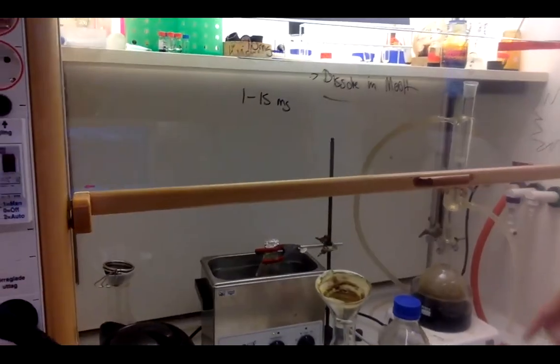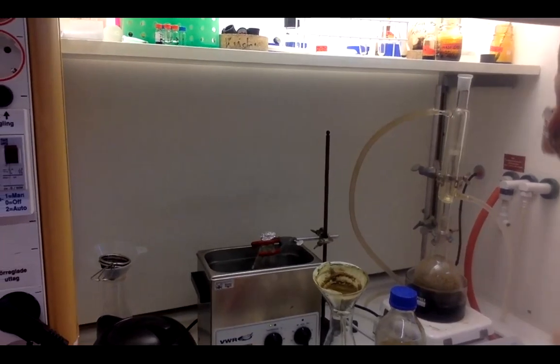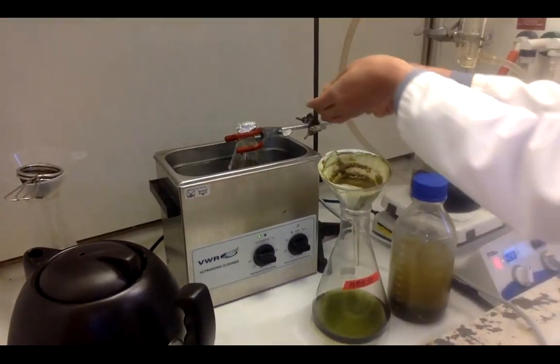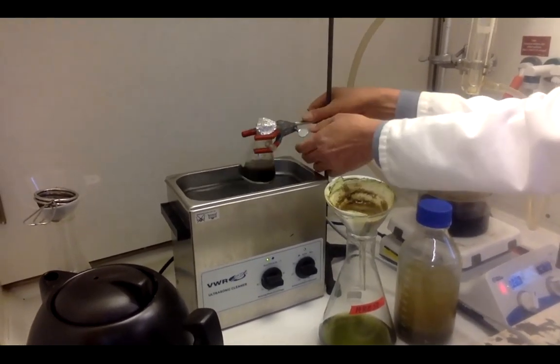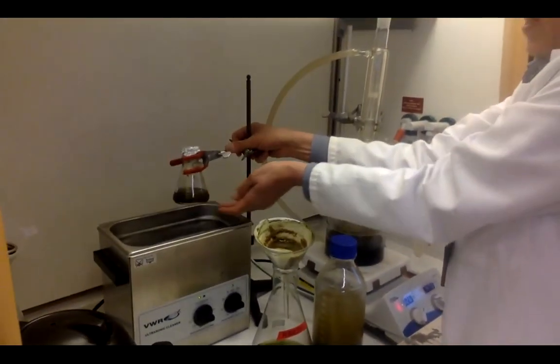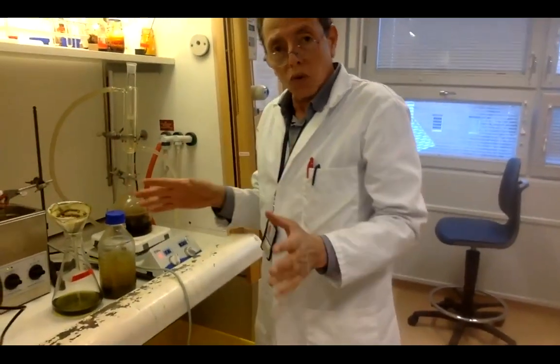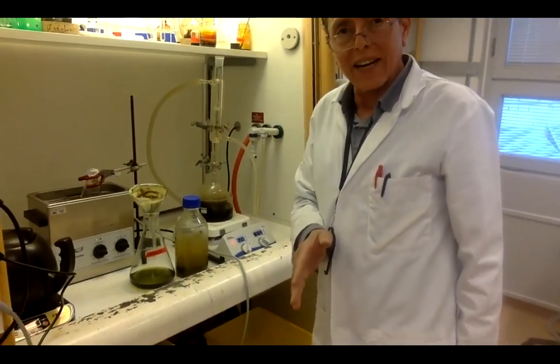Between room-temperature maceration and reflux or heating, there is another method called ultrasonic extraction. With ultrasonic extraction you control time and temperature. You can see the extraction progressing — after two hours the extraction is visible and effective. These are the several methods of extraction available depending on your aim. If you do not know the plant, I advise stepwise extraction using maceration.